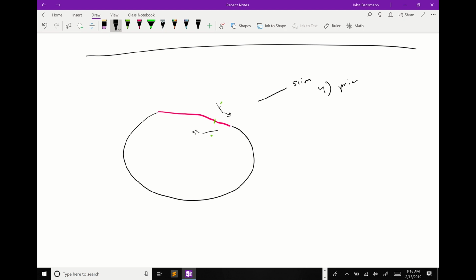In Quickchange, or again, Site Directed Mutagenesis, but you'll hear me say Quickchange just because that's the nickname in the lab I came from. Literally all you do is you make primer 1, primer 2, and they're going in opposite directions, and they overlap like this.